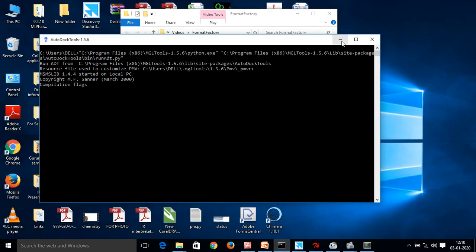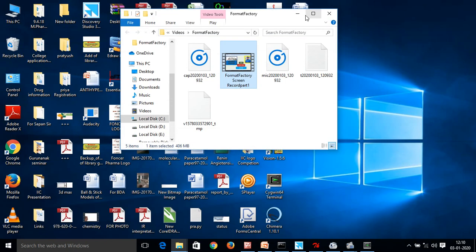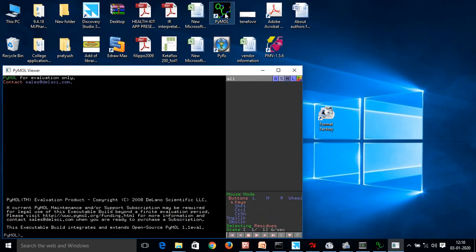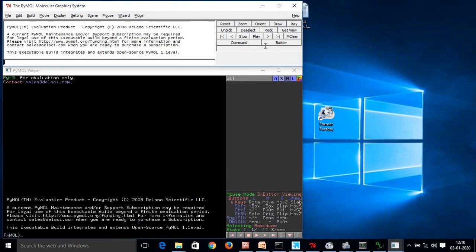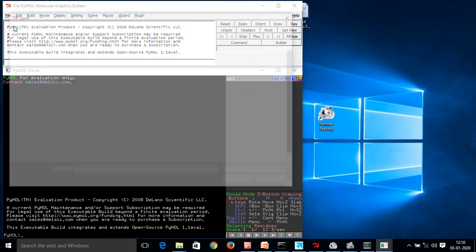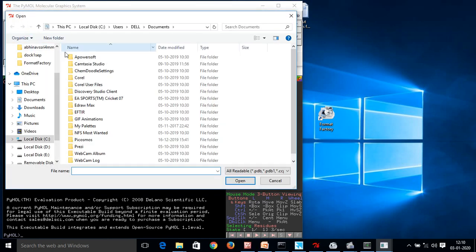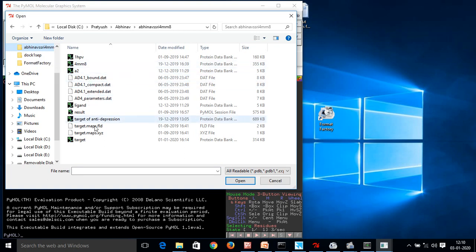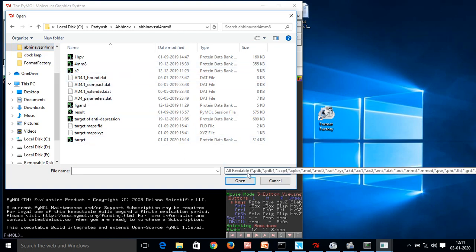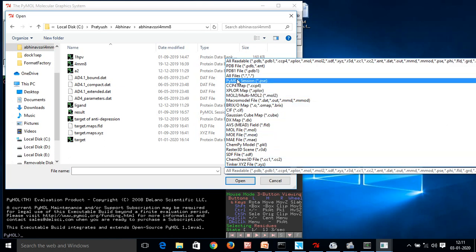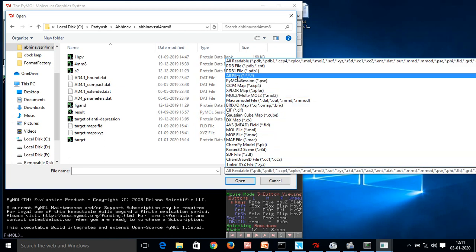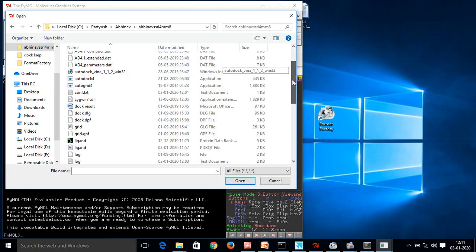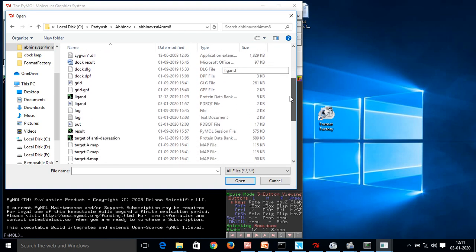So the PyMOL is being installed in my PC. I am going to open it. Go to file, open. Now what we have to open, again I will go to that parent folder which I was working with. Now here what we have to open, I will open my output file. So here you can see that all files. Now you can see all kind of files present in this folder. So this is of our keen interest, out.pdbqt.